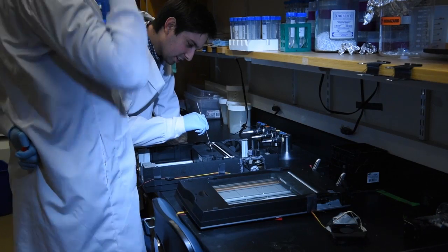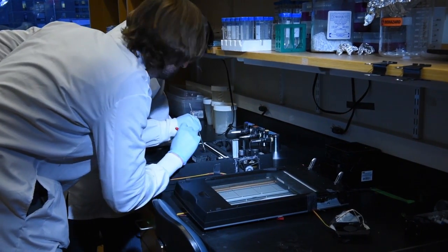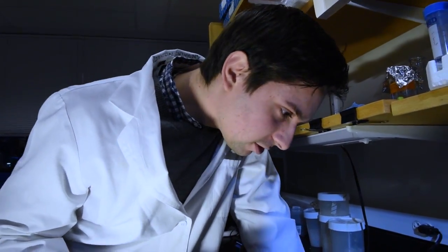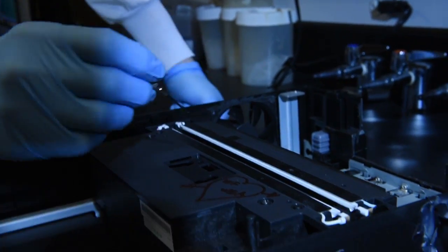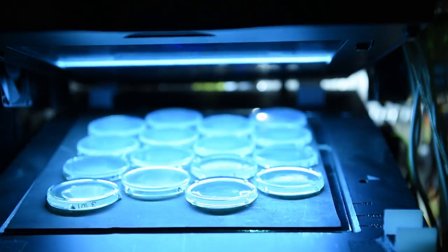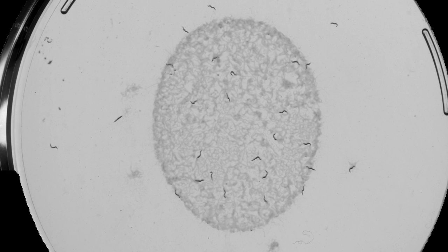And now you have the full story of their lives before and after you do some sort of intervention to them. The Lifespan Machine really starts with individual flatbed scanners, which you retrofit to turn them into biological experimental equipment. A single scanner fits 16 plates, and each of these 16 plates can hold, say, 50 worms. And then you can buy as many scanners as you want.